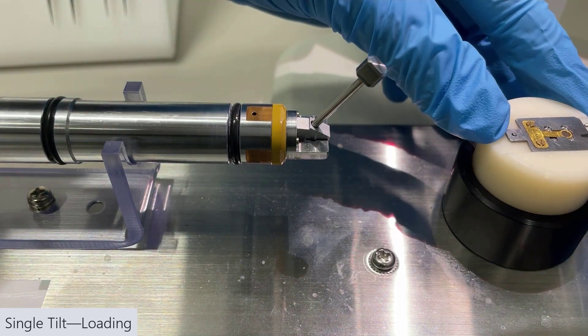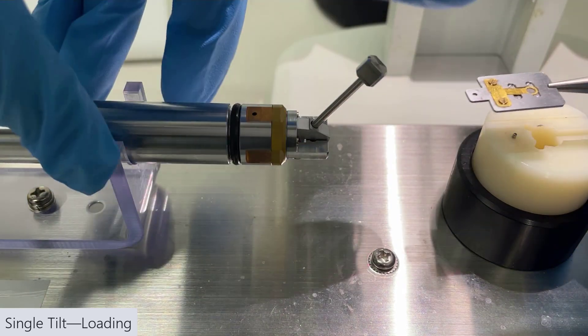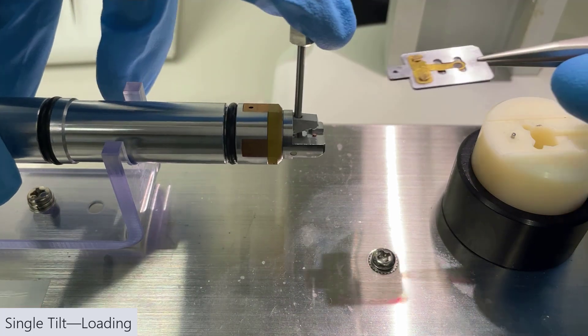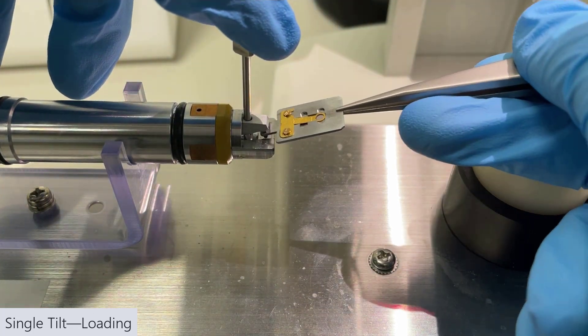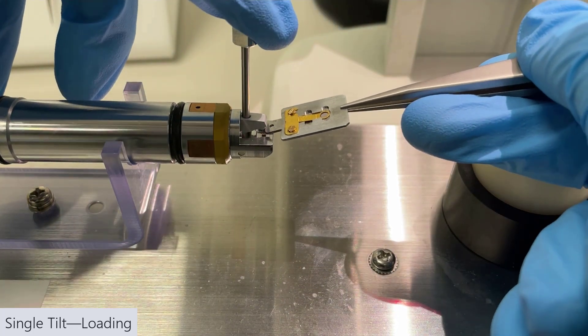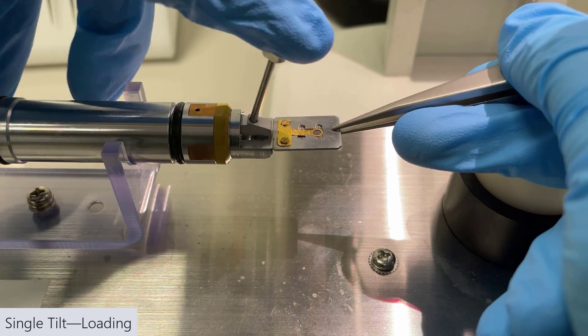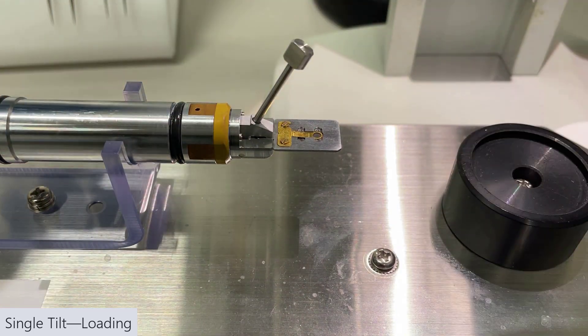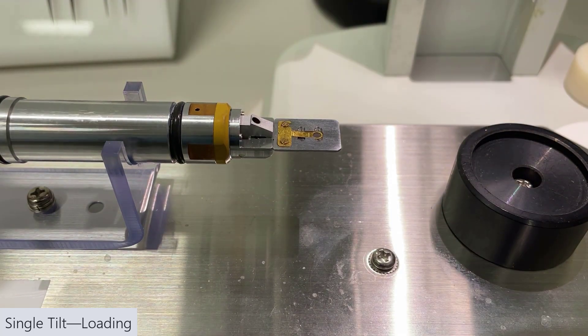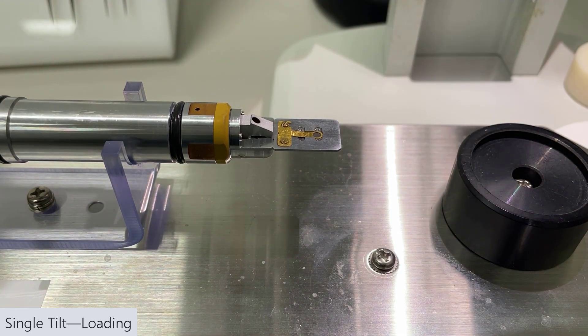Now you do want to be wearing gloves when you're doing this because you're touching the sample rod. We just want that hole to fit in the pin nicely, and then we just drop the lever. Now we want to make sure that it is grasping it, so I'm just tugging on it.